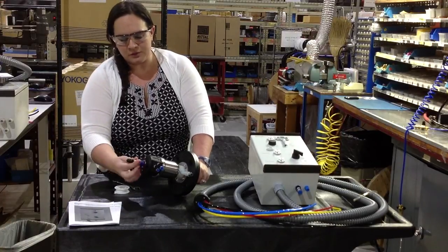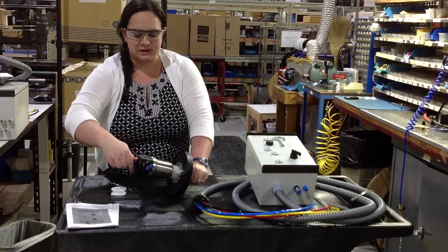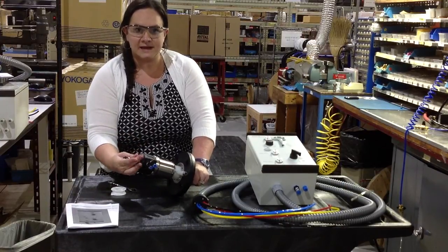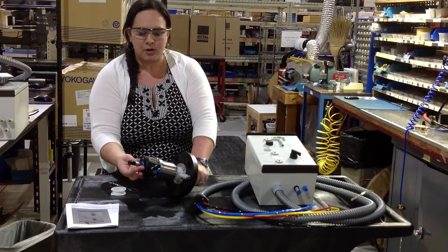You install the PG-13.5 probe into the retractable assembly, and you have to make sure that you get it all the way tightened in there, because if it's not sealed properly, it won't actually operate properly.